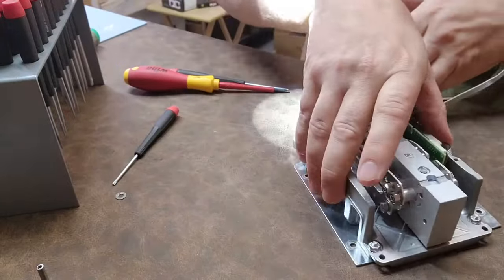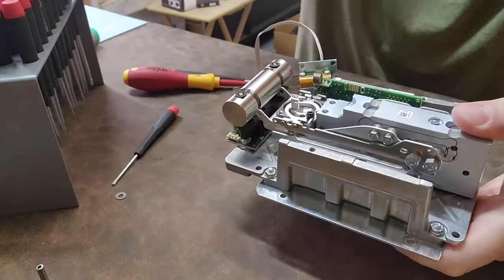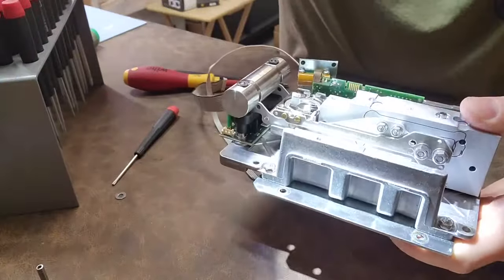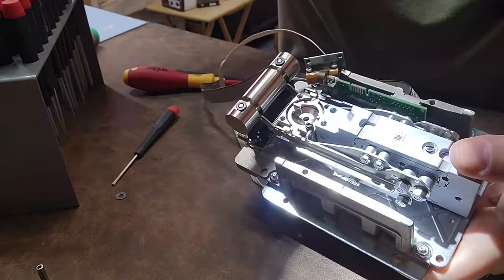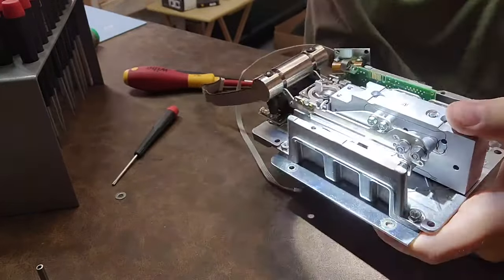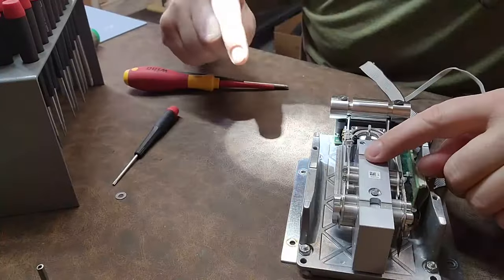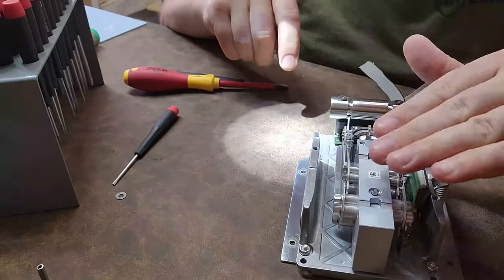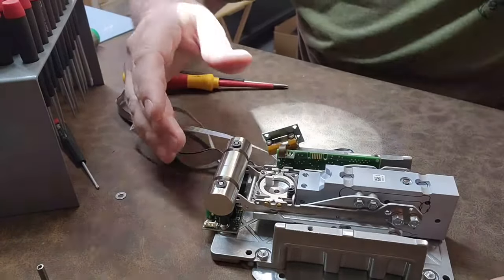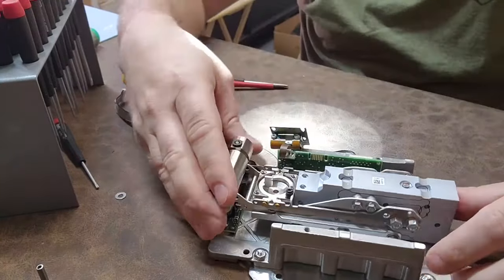Now you can see the wire EDM traces a little better. See the aluminum block — those traces go around and around. It's so sensitive to changes: making a long path means it takes very little force to make it flex, and it's the flexing that creates the load cell properties and allows it to detect. So cool.